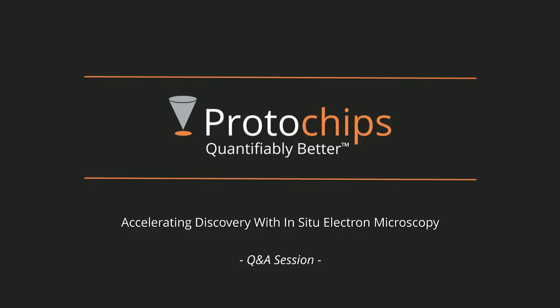So if you read the paper that we published in Nature Communications, it describes quite nicely in the methods section. Basically, when you grow with CVD processes on silicon or silicon dioxide wafers, you can first spin coat some polymethyl methacrylate on the surface of your 2D material, dissolve away the substrate, and then transfer using a wet transfer process onto the chips themselves. In this case, we use a little funnel, and then we evaporate the liquid that the 2D material is floated on until it is positioned right on the microchip device.